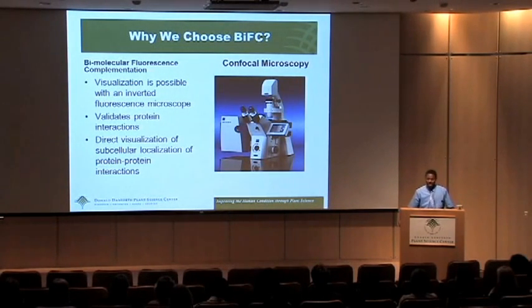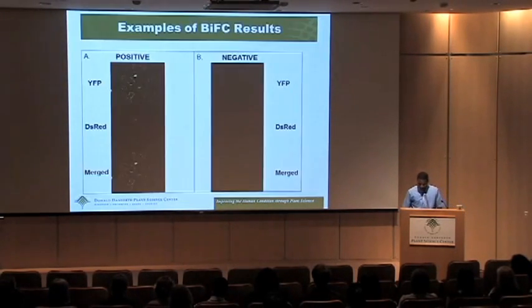So why do we choose BiFC? BiFC is a great method to use in visualizing protein-protein interactions and subcellular localization of protein-protein interactions. It validates protein interactions, and you can validate protein interactions by using the confocal microscope.